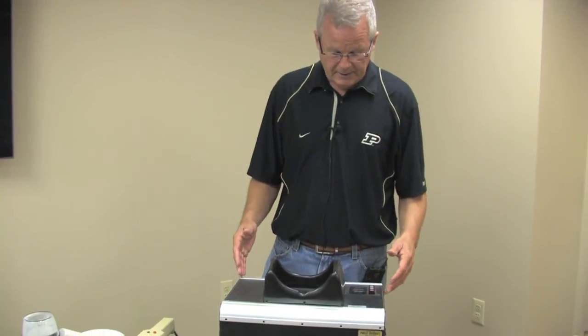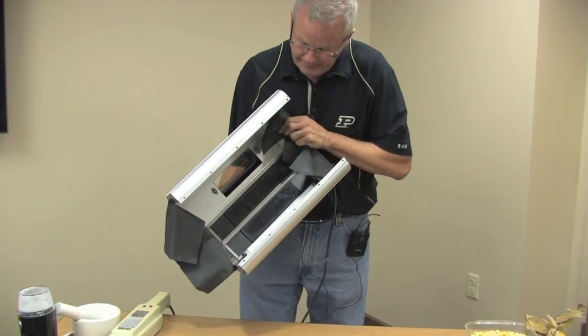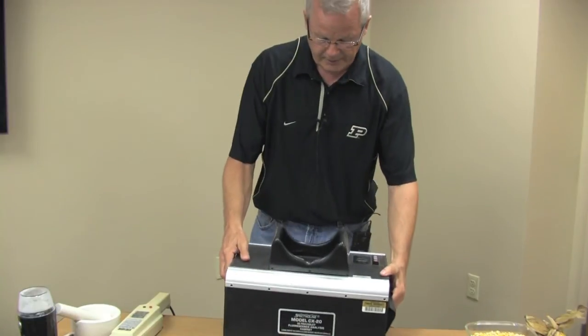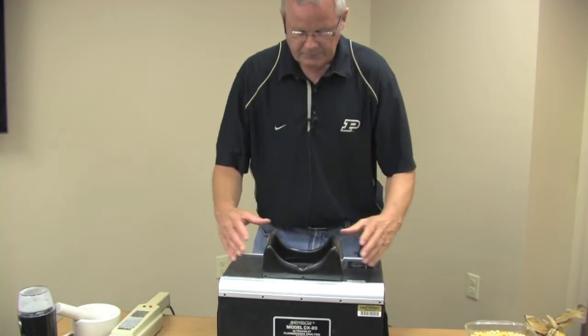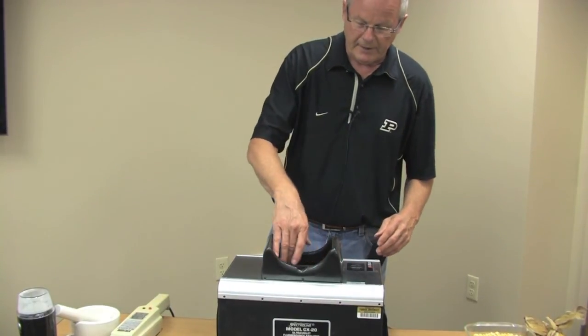You can also make a box like this. It's a simple box with a lamp underneath, which is the ultraviolet light. We have a place where you can put the samples under the box with the light and then look through the top with a protective glass.